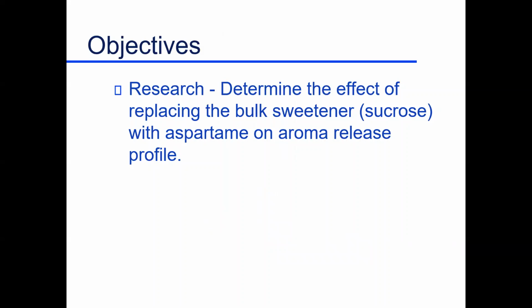Problem is, of course, you guys working with plant protein ruin my day because I can't do any masses that large. Beta-lactoglobulin is perfect for that mass spectrometer. It's not perfect for plant proteins. And so that's where we get stuck with it.